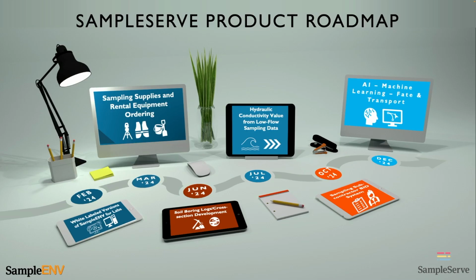SampleServe has other products planned by the end of 2024. Here's a quick summary. First, we're building the ability to offer the platform as a white-labeled application for various laboratories and even some consulting engineering firms. If you're interested in having your own application branded to your company name, let us know. We're teaming up with supply and rental equipment companies. Because of our project management tool, we're able to calculate needed quantities of supplies and equipment needed and place those orders through your favorite supply and equipment rental company.